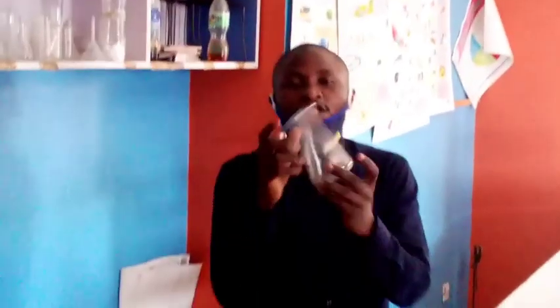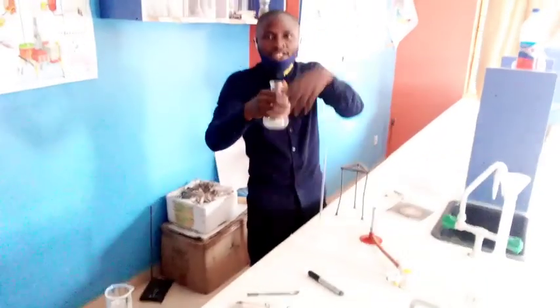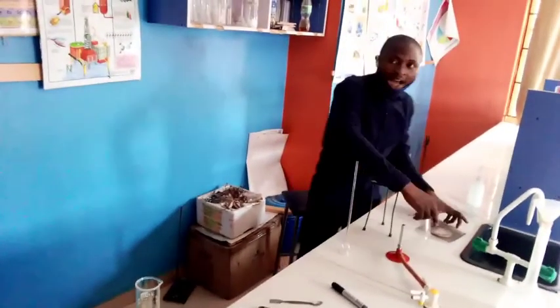And then we have conical flask. This is conical flask. It is used for holding liquid during reaction. For instance, acid-base titration. You pour the base inside of this and you titrate. So what you are actually doing is using this to hold liquid during reaction.